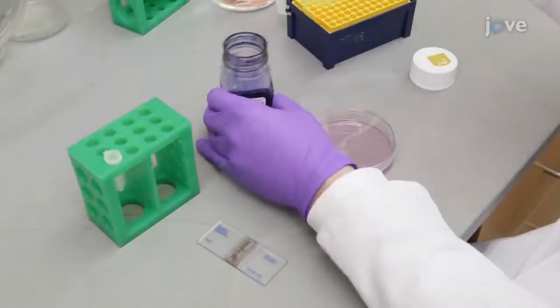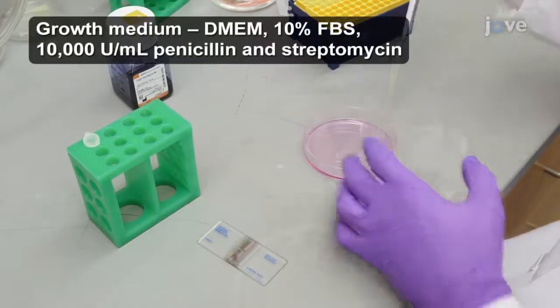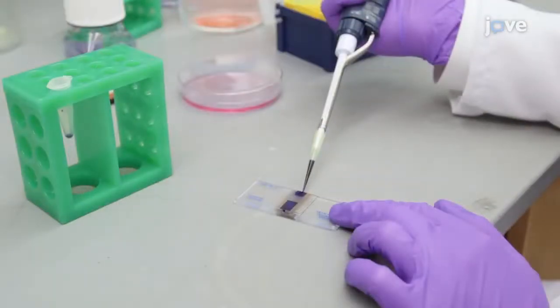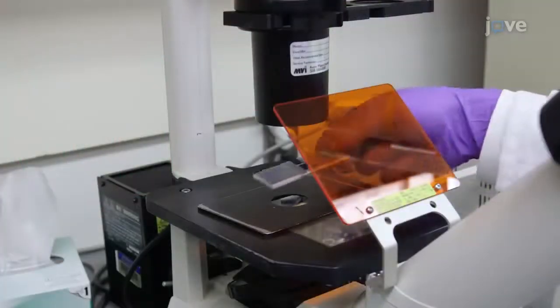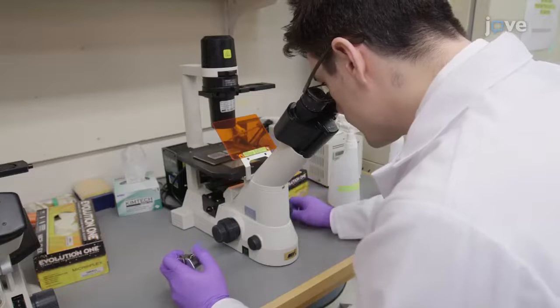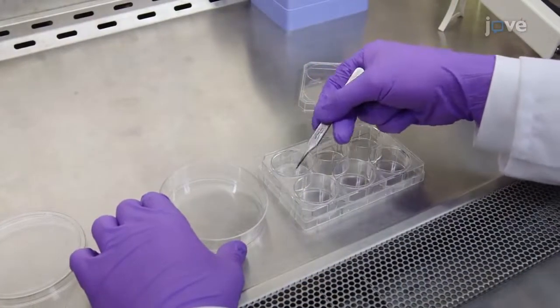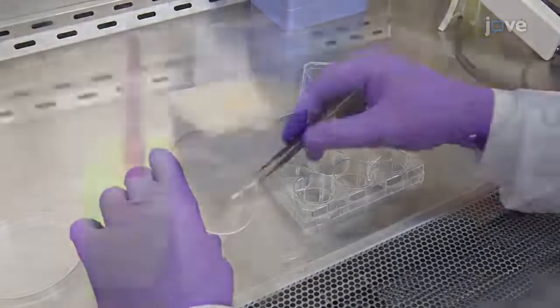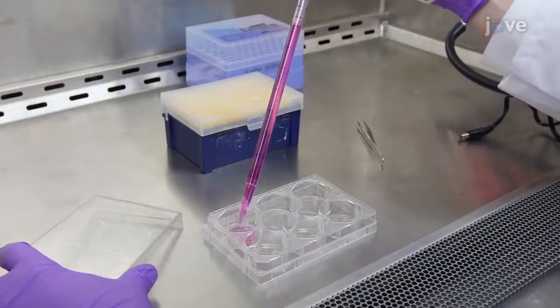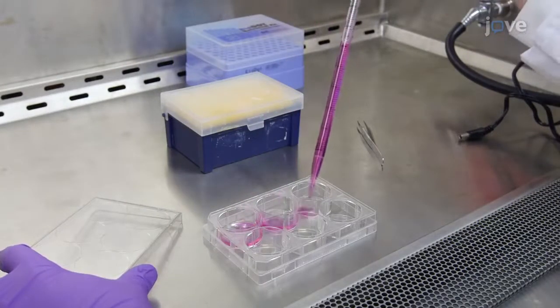A day before imaging, count SW13, SW-Neo, and SW-DKK3 cells grown in a 37 degrees Celsius and 5% carbon dioxide incubator using a hemocytometer. Place sterile glass cover slips into individual wells of 3 6-well plates. Use a separate plate for each cell line and plate the 3 cell lines at a density of 5,000 cells per well into these 6-well plates.